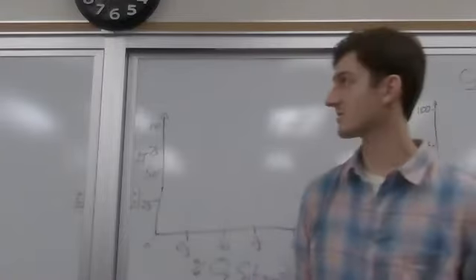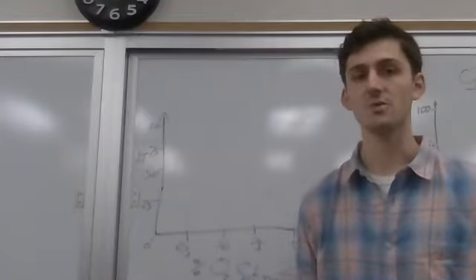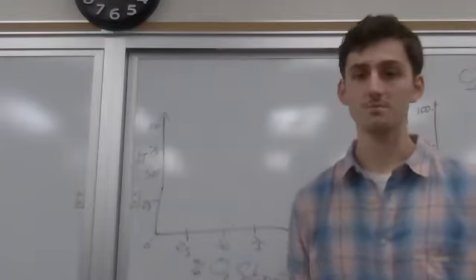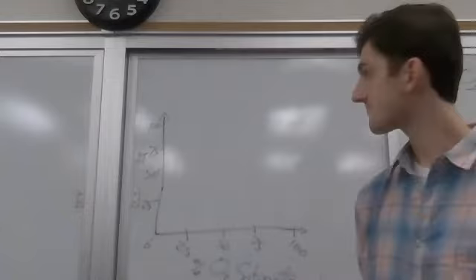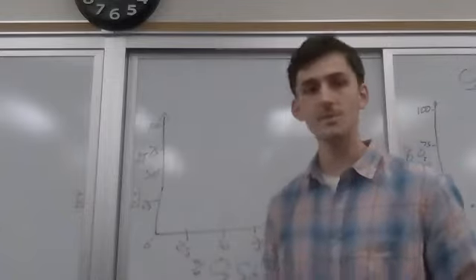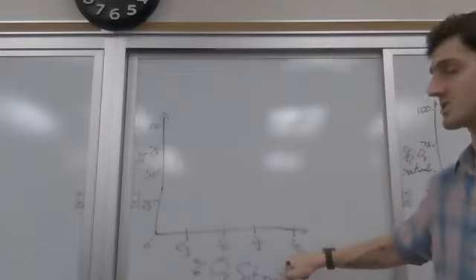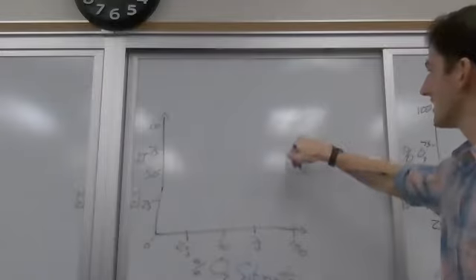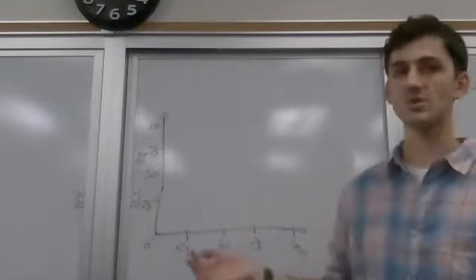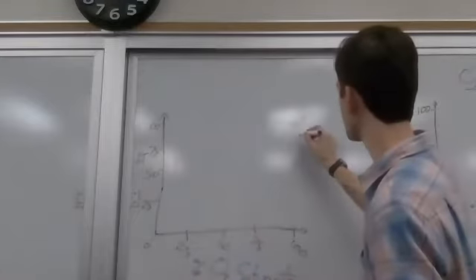So partial pressure is really just a proportion of oxygen, or whatever target gas we want to consider. It's really just a proportion of that gas within a volume that we're comparing. To do this experiment, we made a couple of assumptions. The first was that at 100% oxygen saturation, we had a certain transmittance value. I think the average for all classes was somewhere around 60% transmittance.